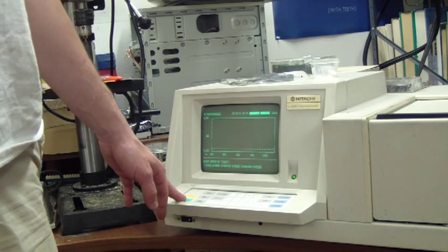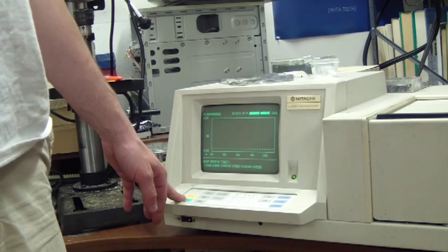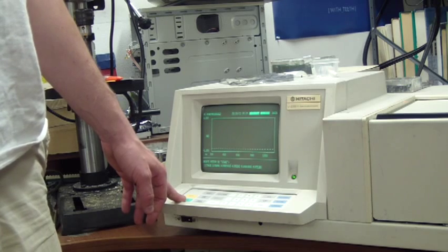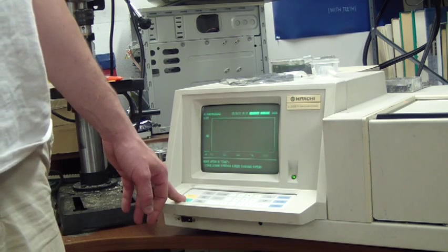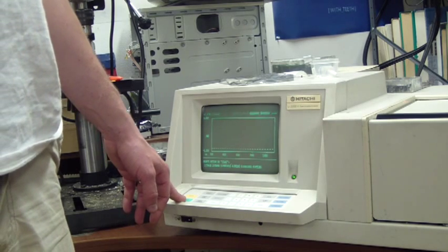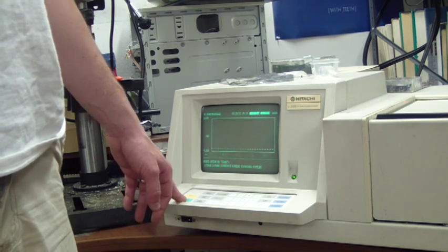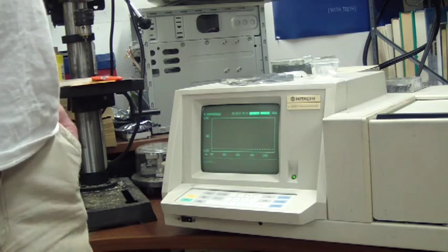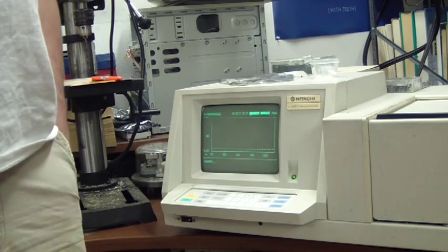We are going to start this right now. I have a piece of plexiglass in the sample chamber which still has the protective coating on. There's a 5 second delay prior to scan.